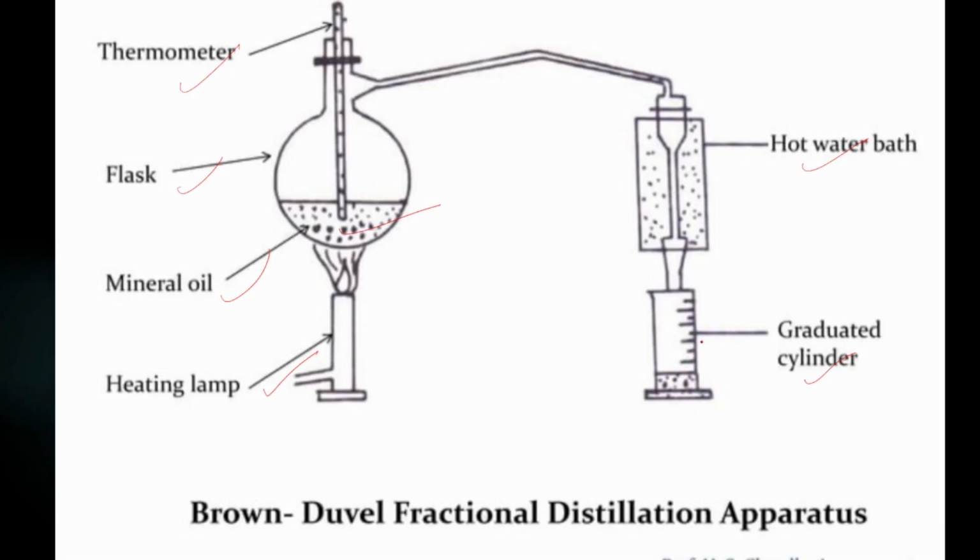Since water and the solvent are immiscible, they form two distinct layers. The water, being denser, settles at the bottom of the receiver. The volume of water collected in the trap is measured, which gives an indication of the moisture content in the original sample. This method is now less commonly used in favor of faster and safer techniques, but it still has historical significance in moisture determination in the older days.